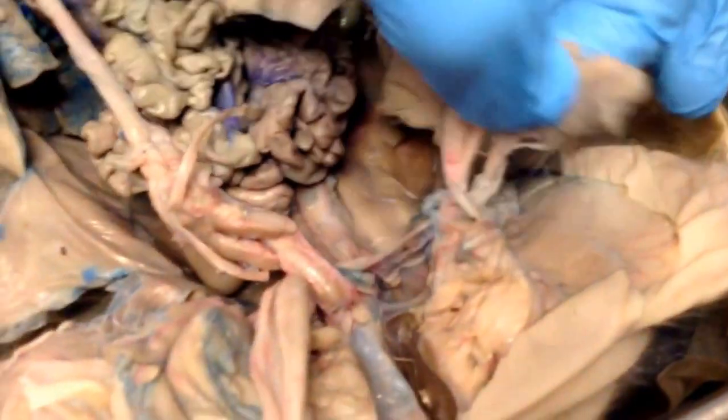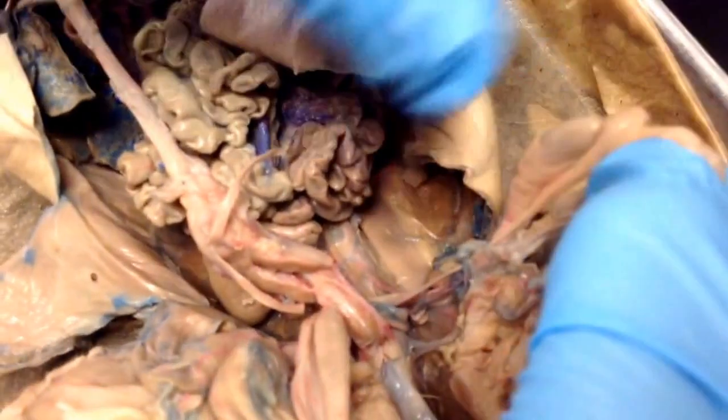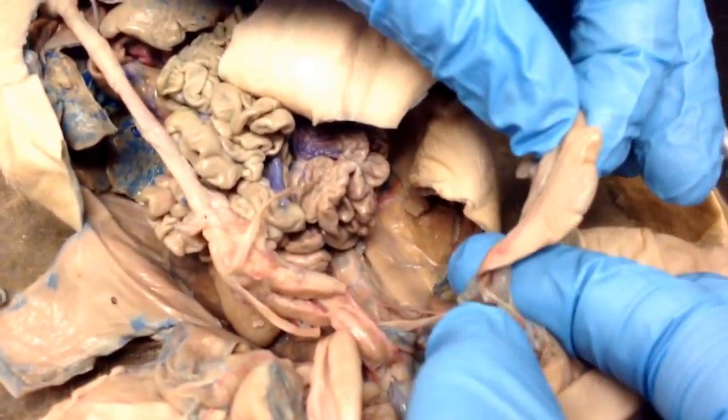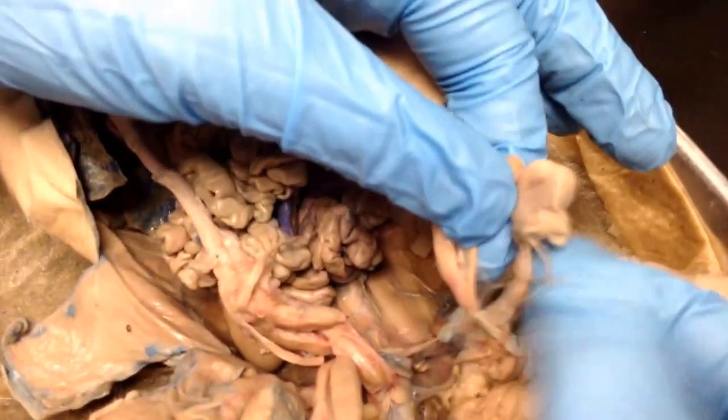And that shows the gubernaculum. I don't know, but that doesn't make sense because he said the gubernaculum attaches to the testis, and it should be just a little flap of skin. So I don't know really where it would be. What's this?